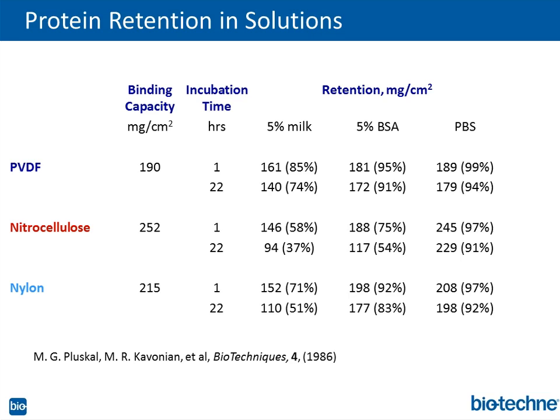Is after you do your transfer, take that membrane, and I like to of course rinse the blot in nice high purity water, because you want to get rid of all the non-specific stuff that can cross-react and cause high background. And if you didn't know, as a side note, pyrogens, sodium azide, EDTA, they all inhibit horseradish peroxidase, HRP. And if there's any of that potentially there, guess what's going to happen? You're not going to get a signal. So get rid of all that.